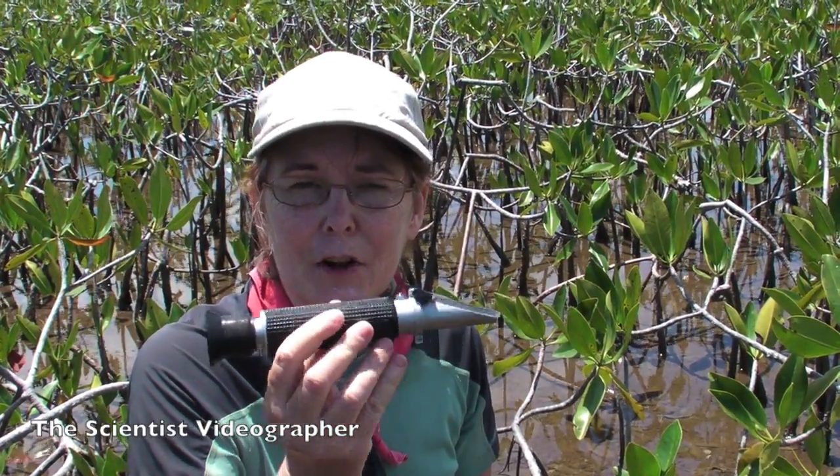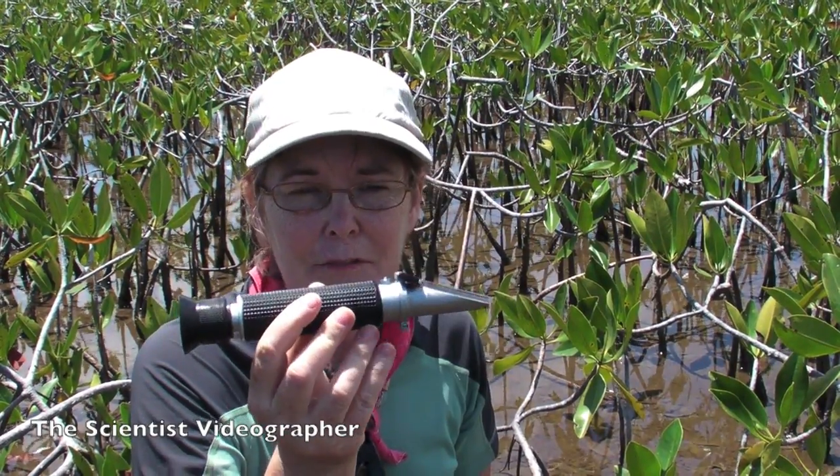In the field we carry an instrument called a refractometer. It's very portable and fairly small — you can fit it into a backpack — and it measures the refractive index of a solution.